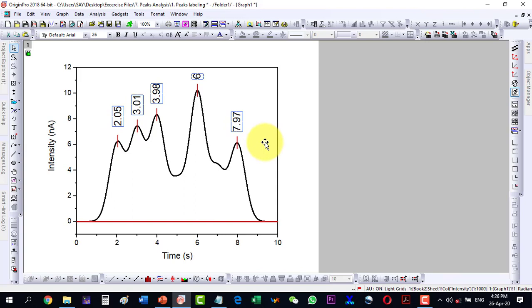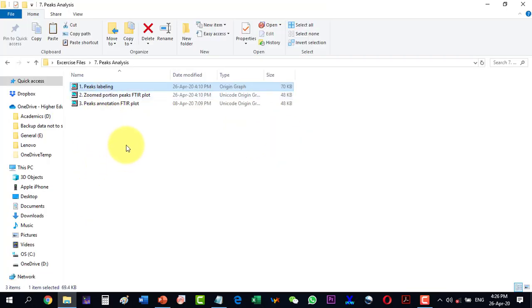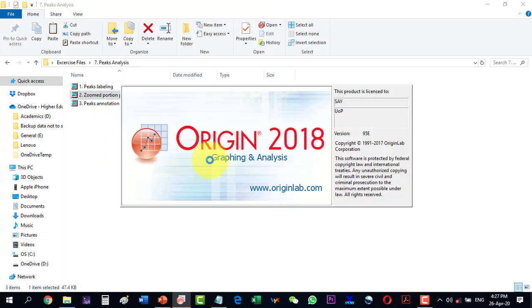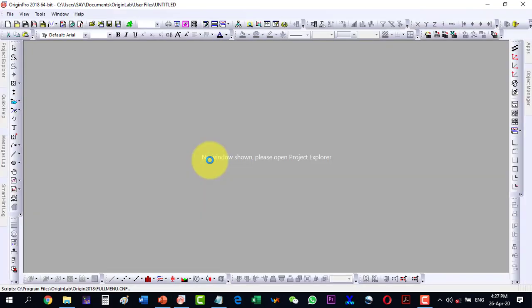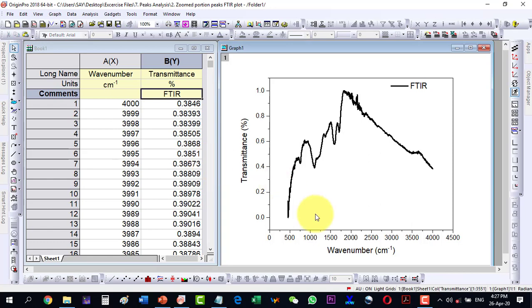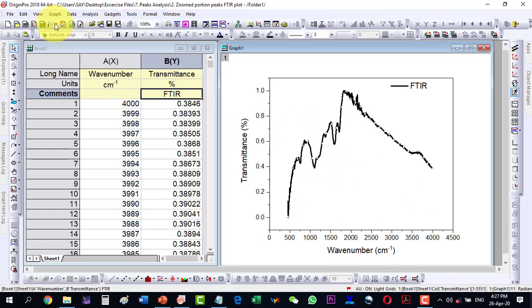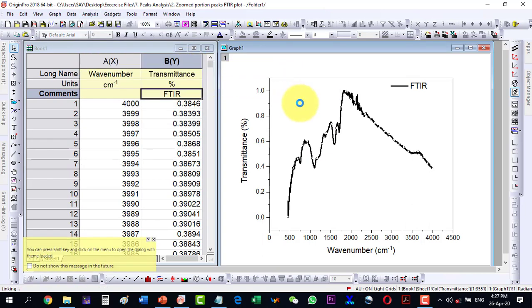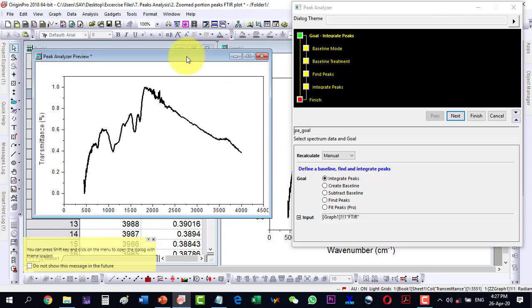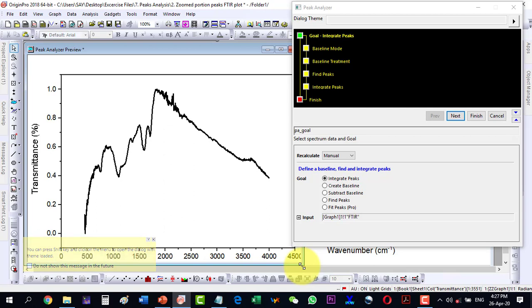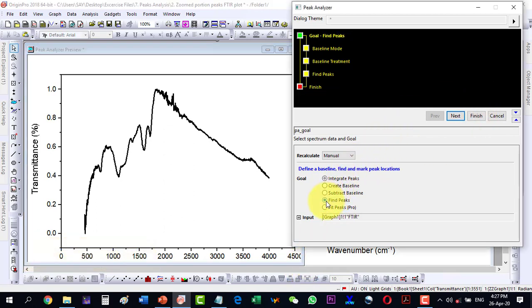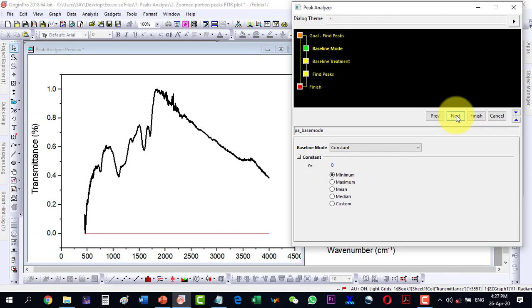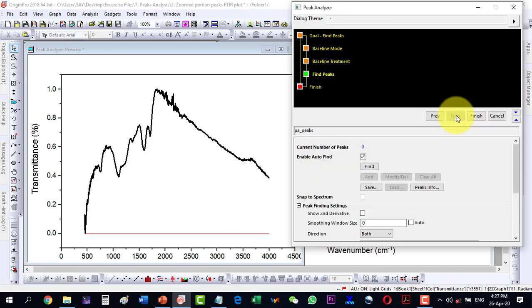This way we can find peaks in an Origin file. For a complex plot such as an FTIR plot where there are many oscillations, it is very hard to find peaks with auto-find. For example, I select this plot and go to Analysis, then Peaks and Baseline, Peak Analyzer, open the dialog, select Find Peaks, click next, keep the baseline as constant, and click next again.